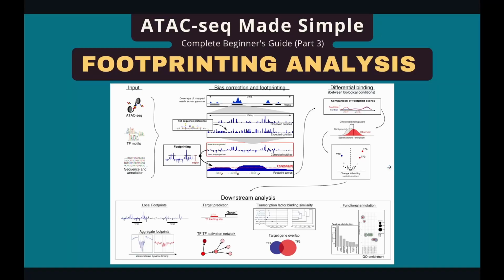In this video, I'm going to show you how to perform footprint analysis in ATAC-seq data. So what is footprint analysis? Simply speaking, footprint analysis identifies transcription factor binding sites in the genome.